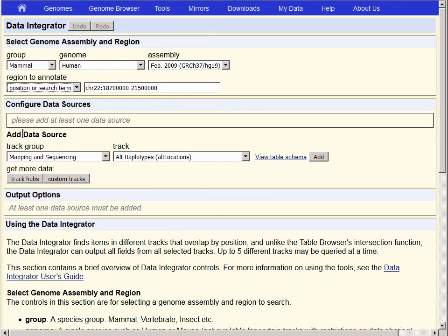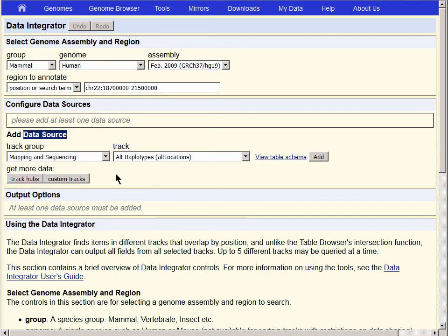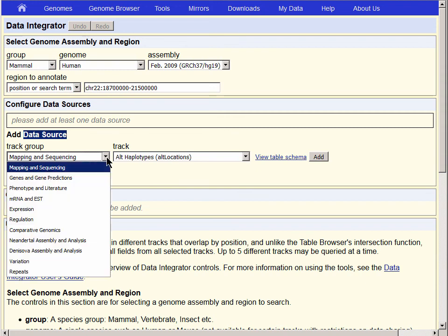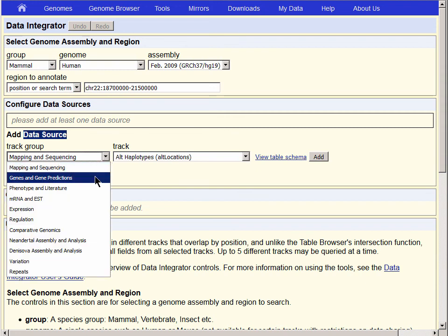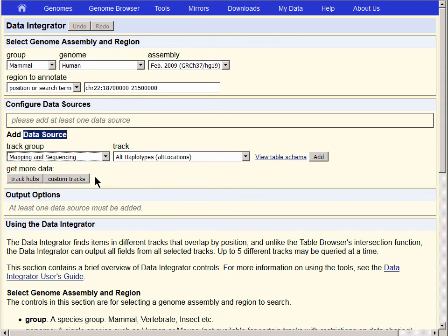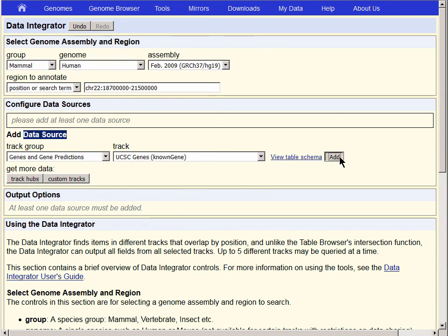We'll begin by adding data sources, and we'll start with the Track Group Genes and Gene Predictions, and we'll add the UCSC Genes Track to the list of tables that we're going to interrogate using the Data Integrator.